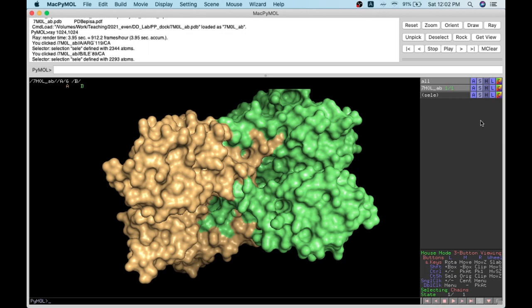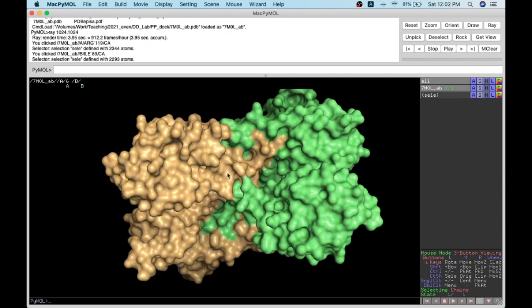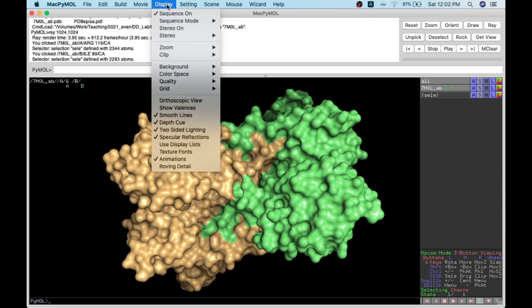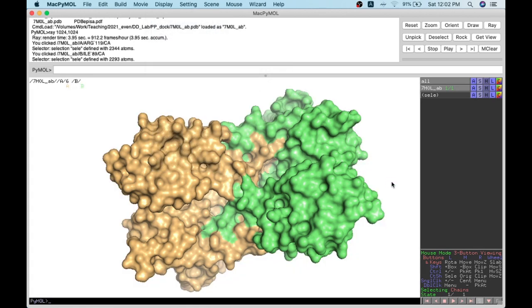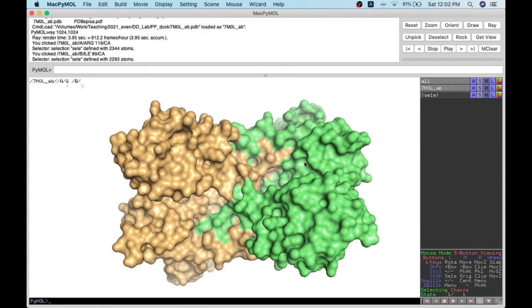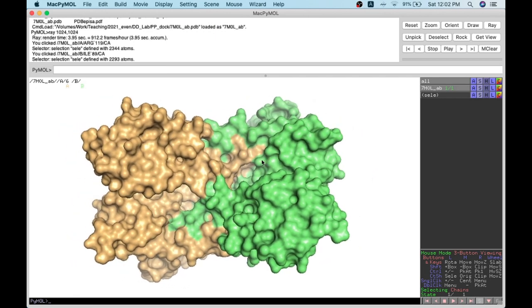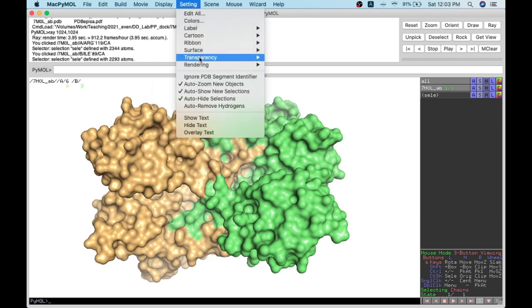If you want to keep the cartoon and sticks selectively, I can show you that. I prefer to keep the background white when making images for publication — black background is suitable only for PowerPoint presentations. When preparing reports or publications, always keep the background white, as that looks good when printed on a white sheet. In settings, you can also remove shadows and modify different light settings.